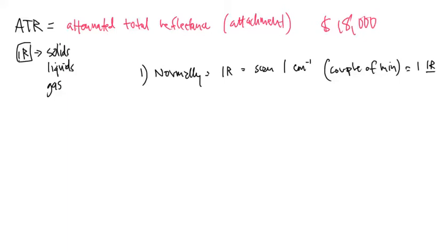With an ATR attachment and with what we call an FTIR, your analysis can be basically shortened from a couple of minutes to a couple of seconds.